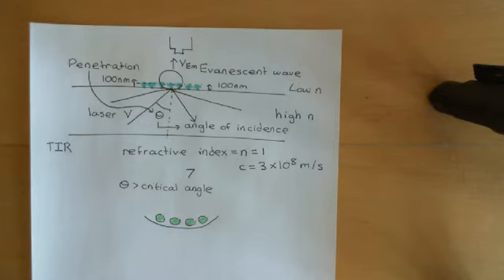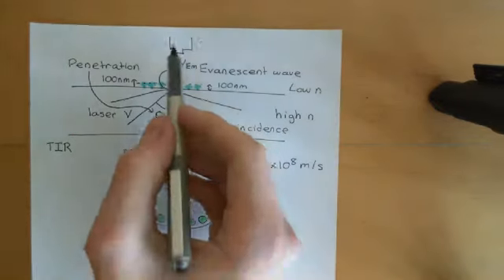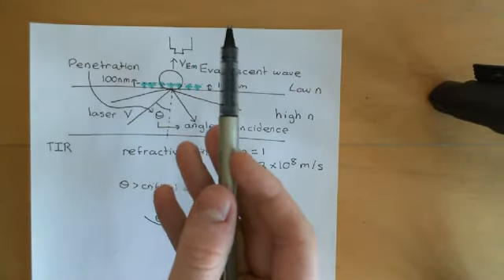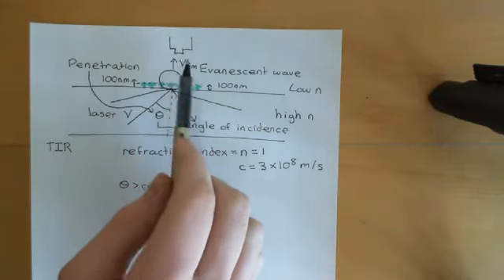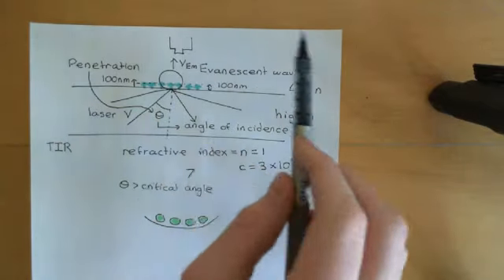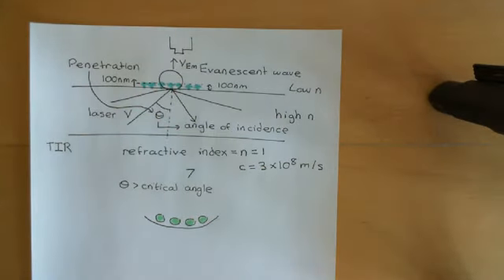The limitation to it is that the time lapse between two images is quite a long time. It takes a long time to take each one of these photos, so the video that you build is quite fragmented. And when exocytosis, especially in axon terminals, is occurring in milliseconds, it's difficult to capture that process with a camera that has such a large time lapse between two photos. Still, it is a useful tool.